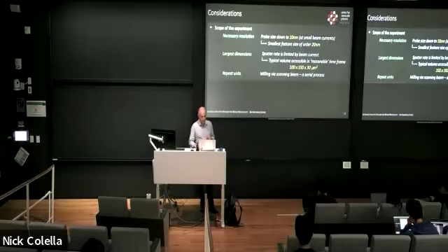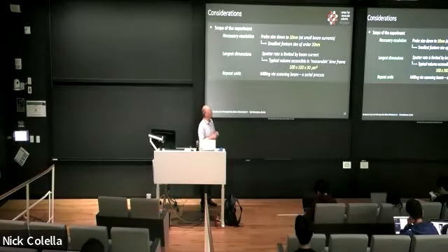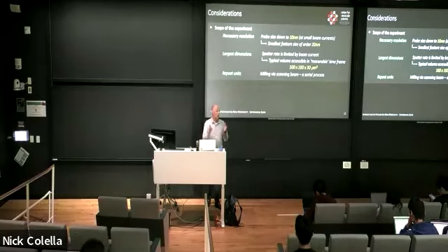So when you work with the focus ion beam, there are certain considerations that you have to think about. The degree with which we can focus the ion beams depends very strongly on the current, how many ions we apply into the beam.